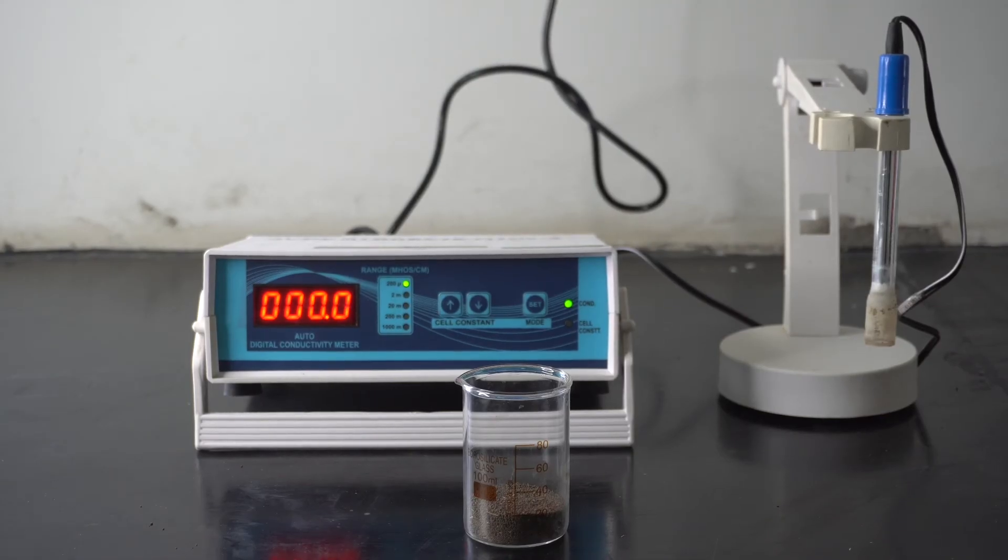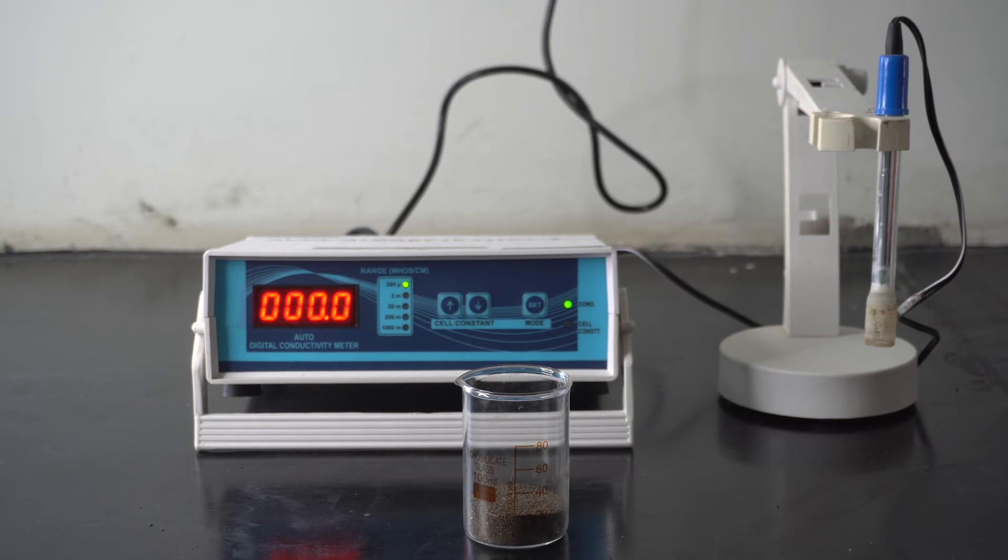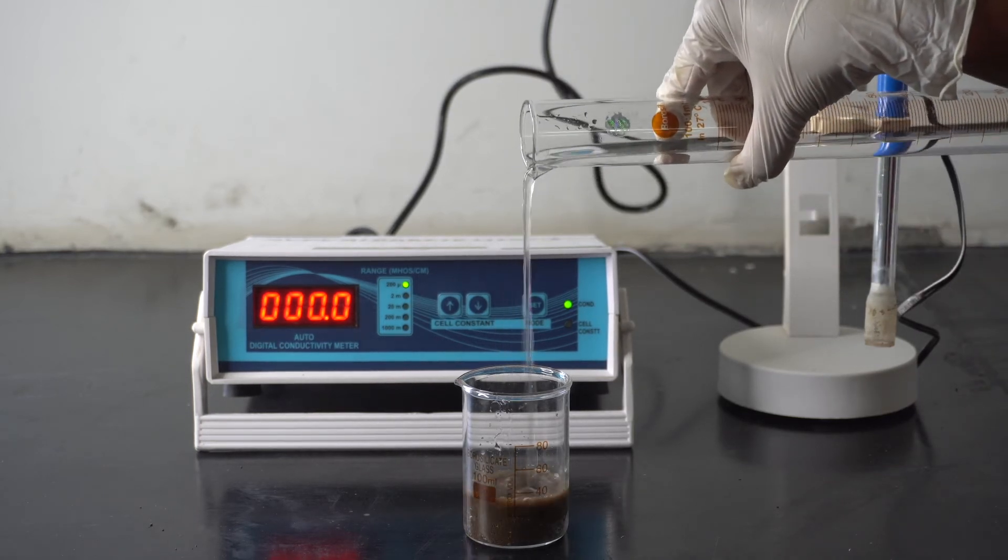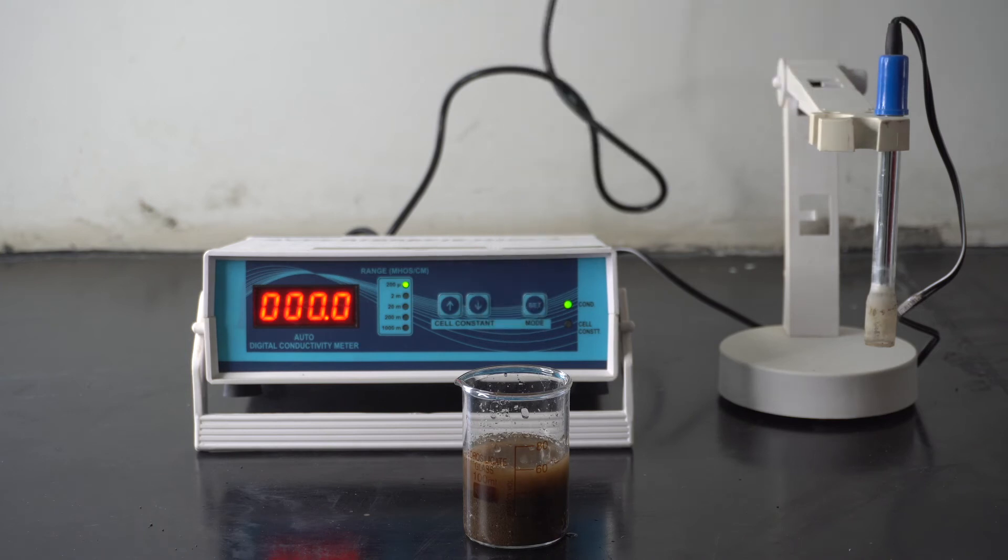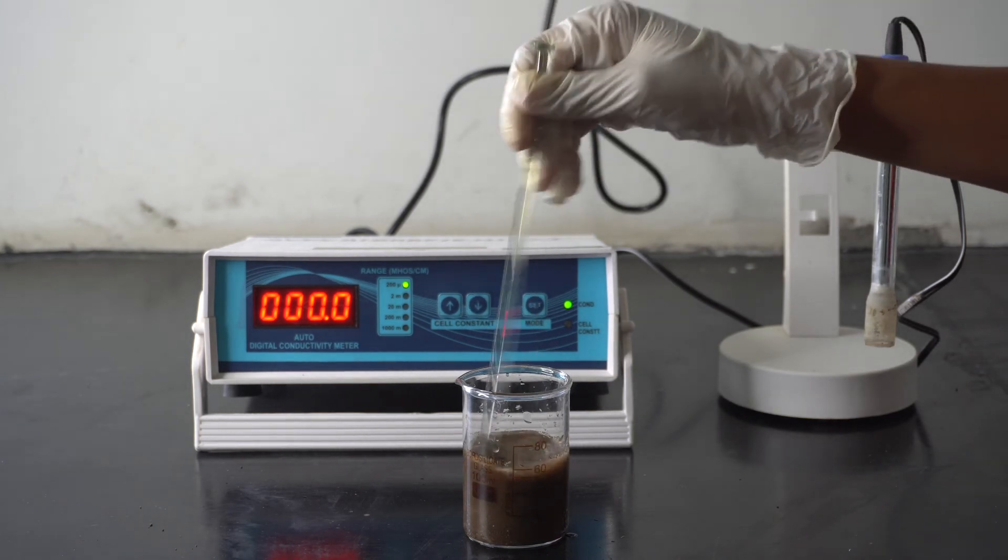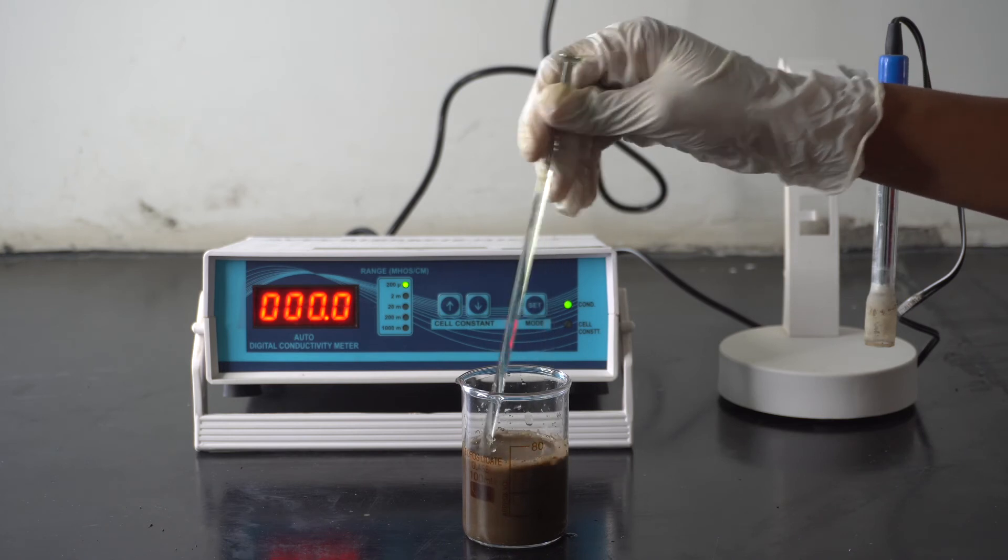Weigh 20g of soil sample and add into a 100ml beaker. Add 50ml of distilled water into the soil sample and stir it with the help of glass rod or stirrer for 30-60 minutes.